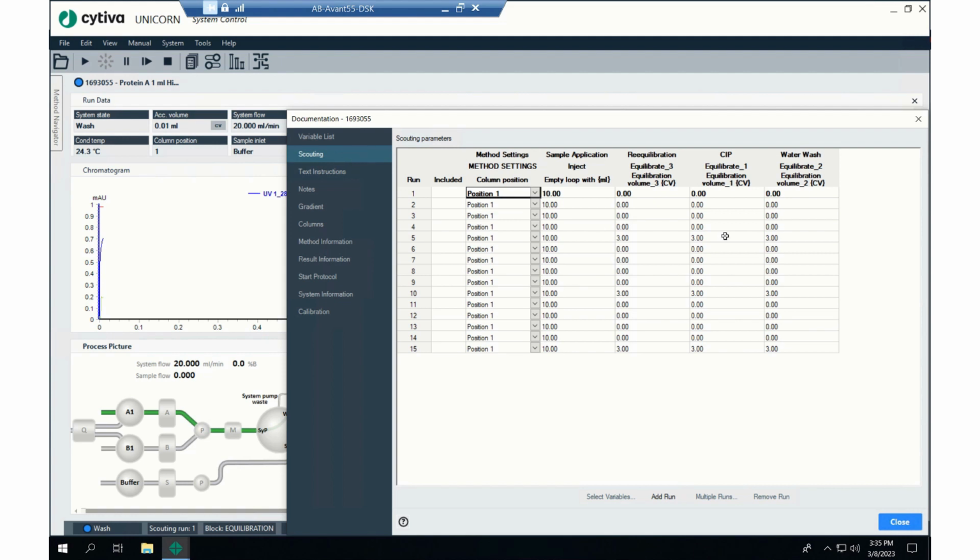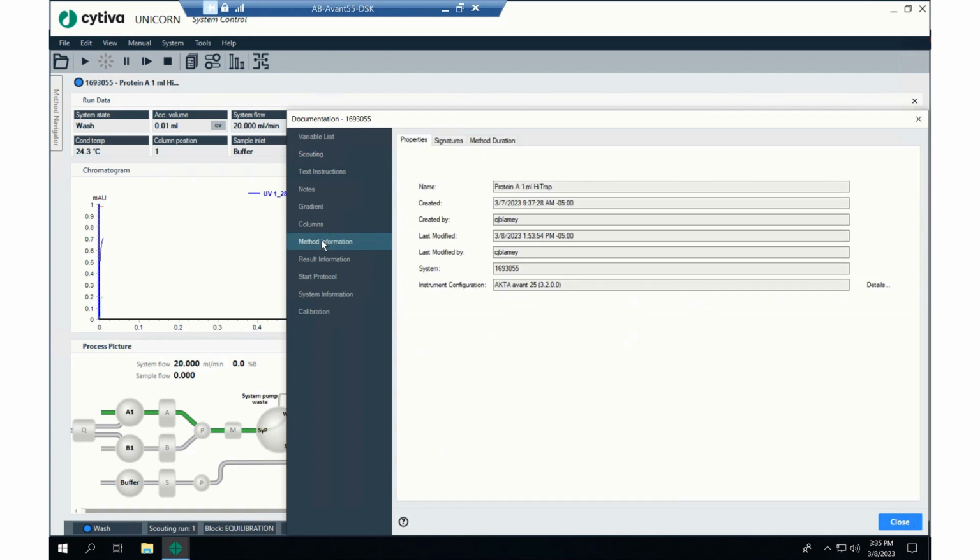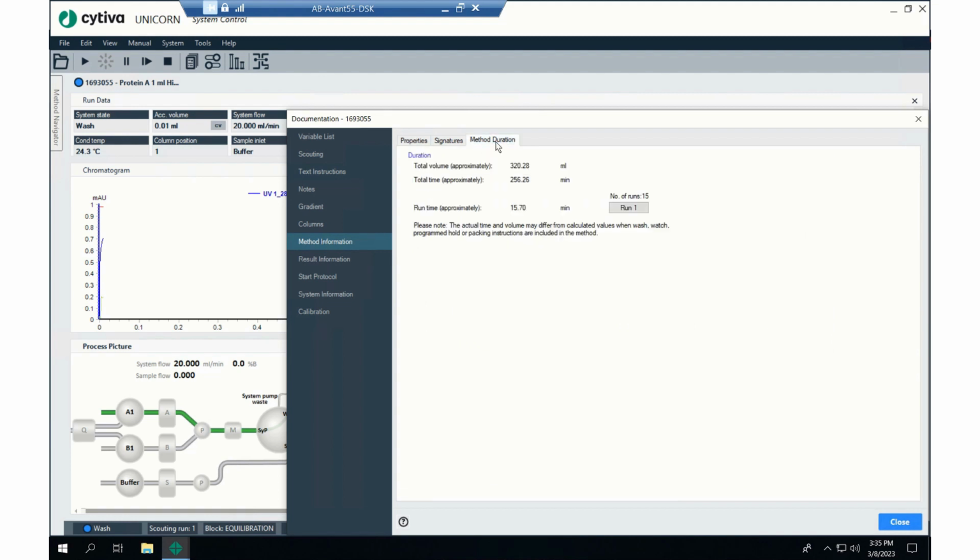So here's scouting, right? And we can go to the method information and then method duration. So it's going to take 256 minutes. So what is that, almost 5 hours? So 4.5 hours, I think.